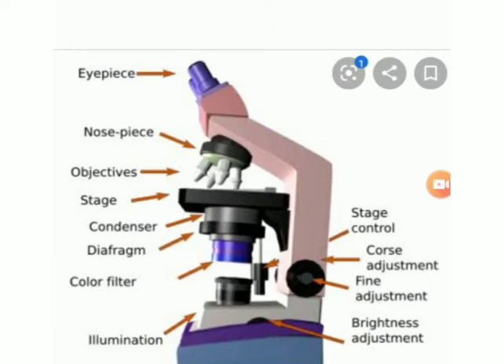Then, using the coarse adjustment knob, focus the tissue under the objective lens at 4x magnification. Next, with the fine adjustment knob, we can do fine focusing.